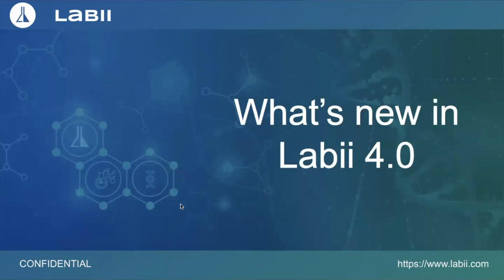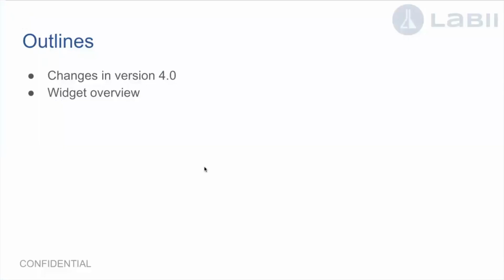During the pandemic, we focused on updating the new features, and we were able to do that, even though most of us are working at home. So here's a new version we recently released, and I would like to give you some updates. Today will mostly focus on the new version, and then I will also give you an overview of all the widgets that we developed in the past year.